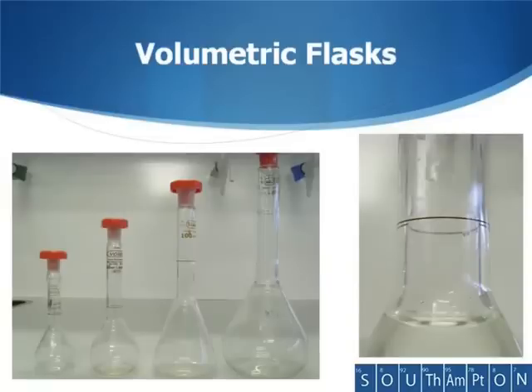It's worth noting that there are various different sizes of volumetric flask that you can use for different applications. Here are a few examples on the screen.